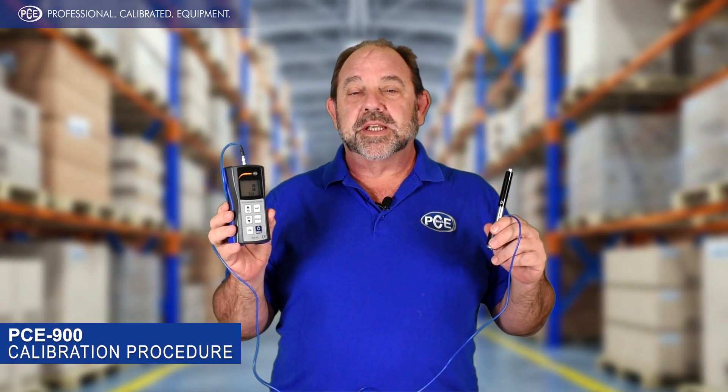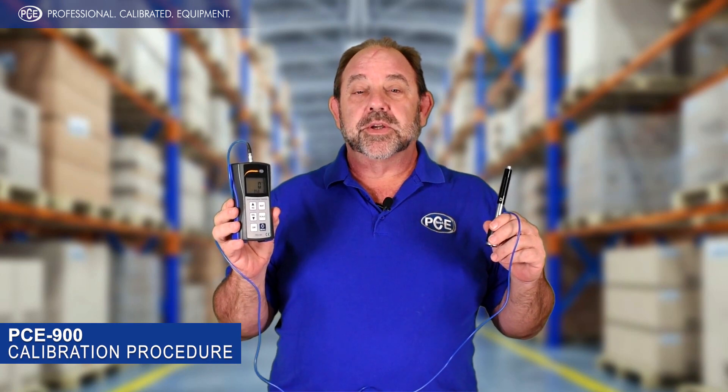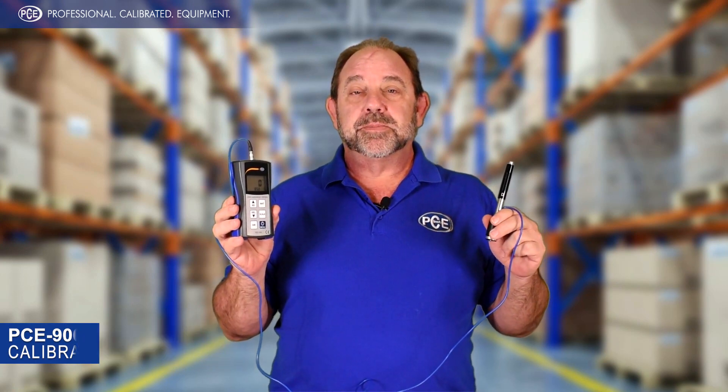Hi, I'm Rob Hines from PCE Instruments. Today I'm going to show you the calibration procedure for the PCE 900 Hardness Tester.